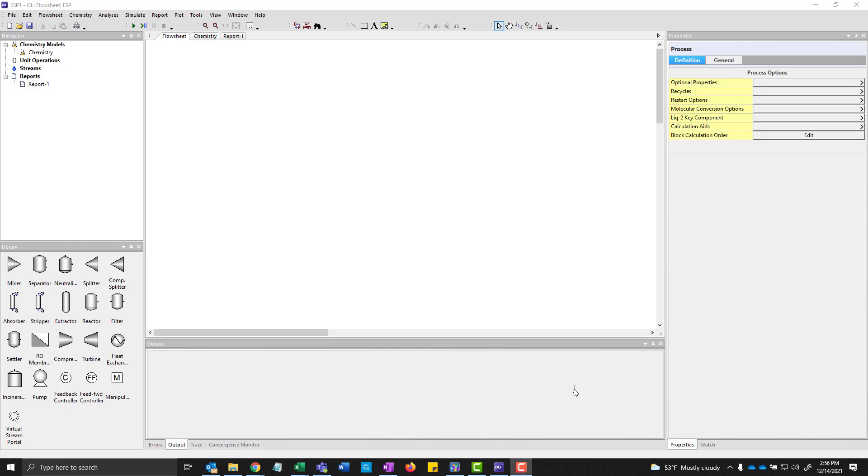Hi, I'm Jim Berthold from OLI Systems and today we're going to talk about water samples and OLI flowsheet. The screen before you is OLI flowsheet version 11 and we're going to start by first adding a water sample. This is cations and anions which are from a lab someplace and we're going to use it here in the software.